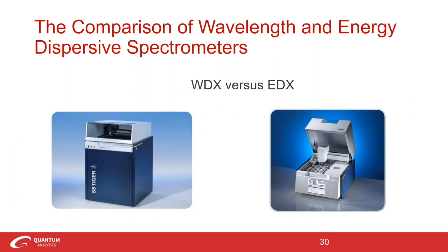This is the nitty-gritty here. So let's take a minute to just do a comparison of wavelength to energy dispersive spectrometers, because there is a good time to apply one versus the other. And sometimes your application may lend itself to one over the other.